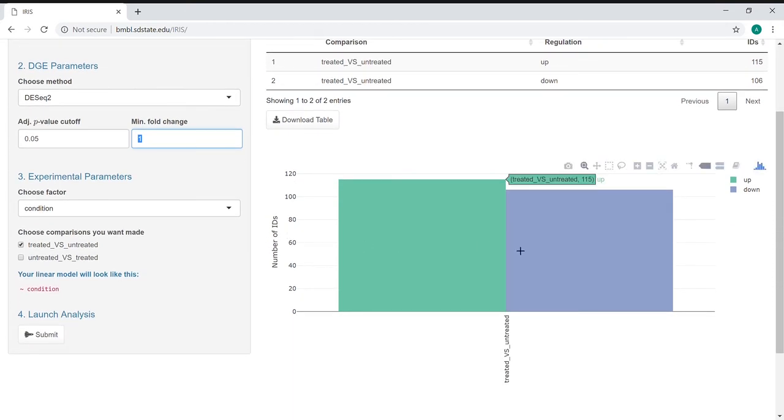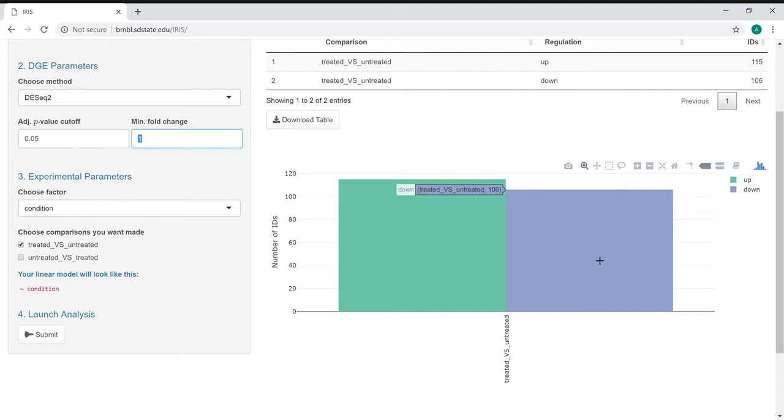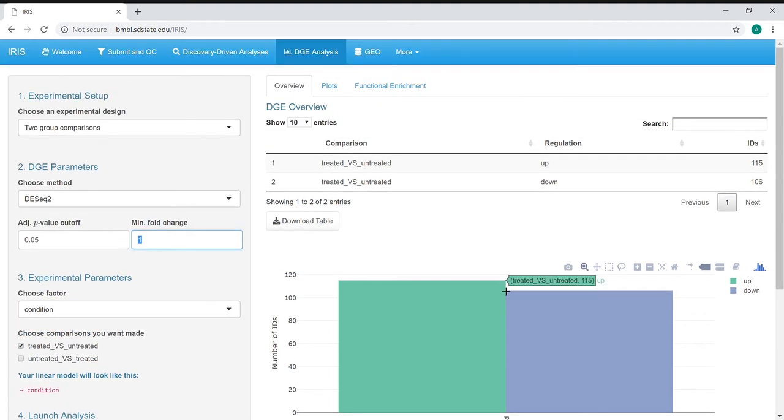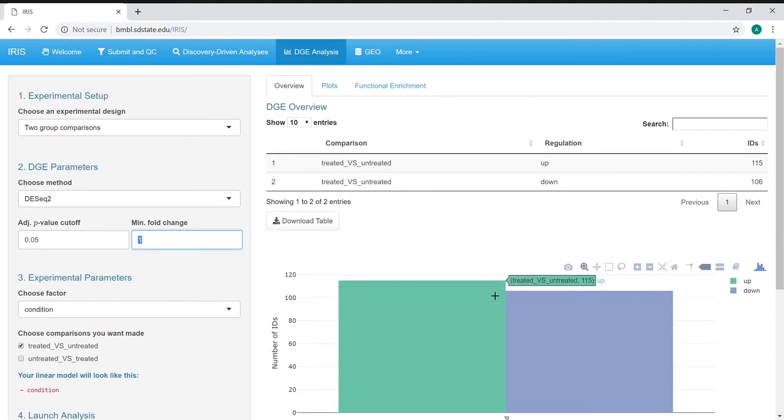We also have a bar plot here that shows the number of up and down-regulated genes, especially if you have multiple comparisons being made. You'll see a lot more information here as well.